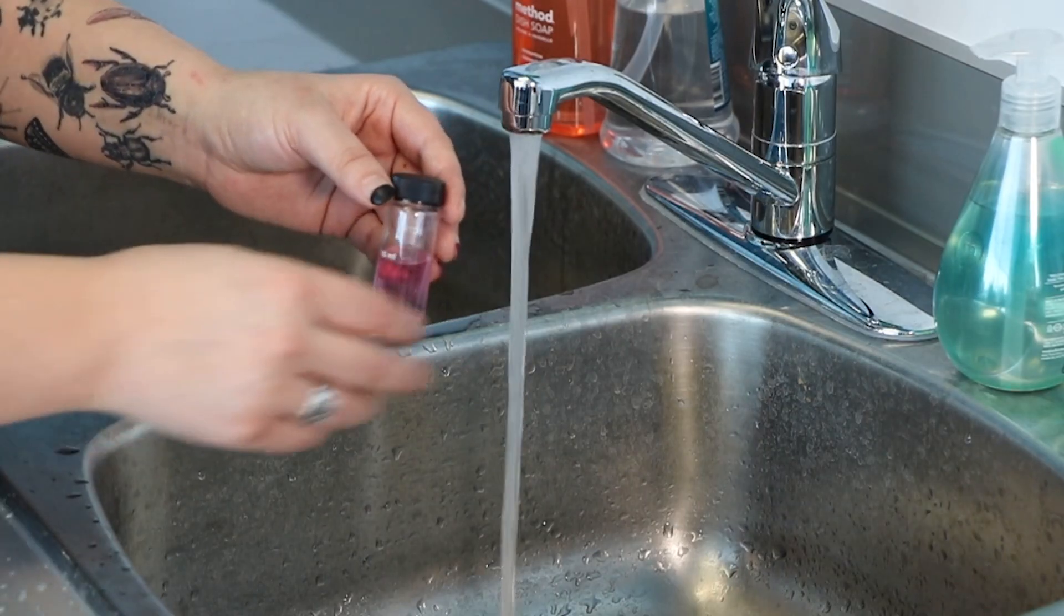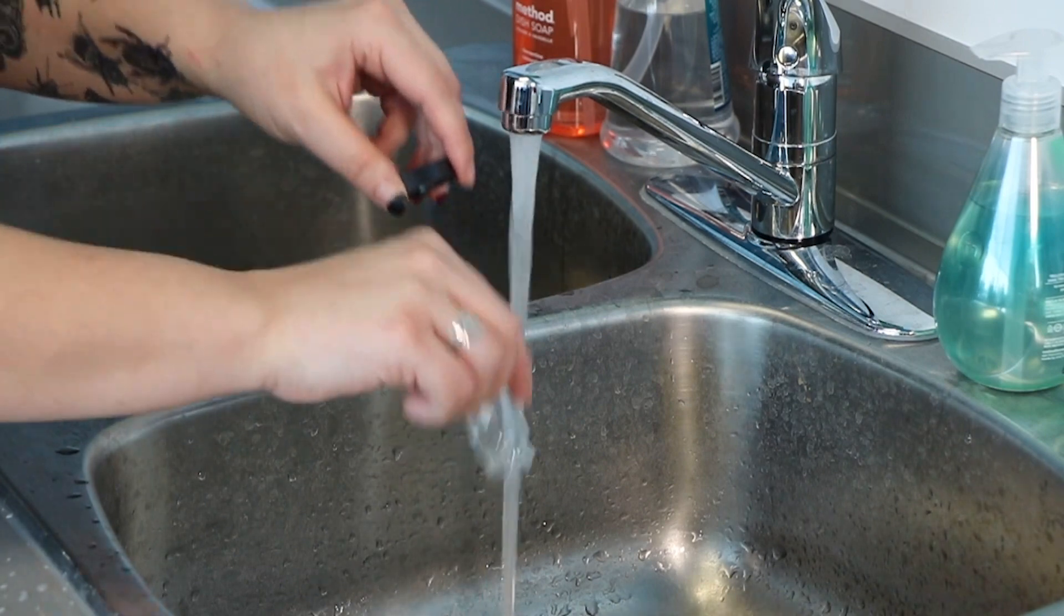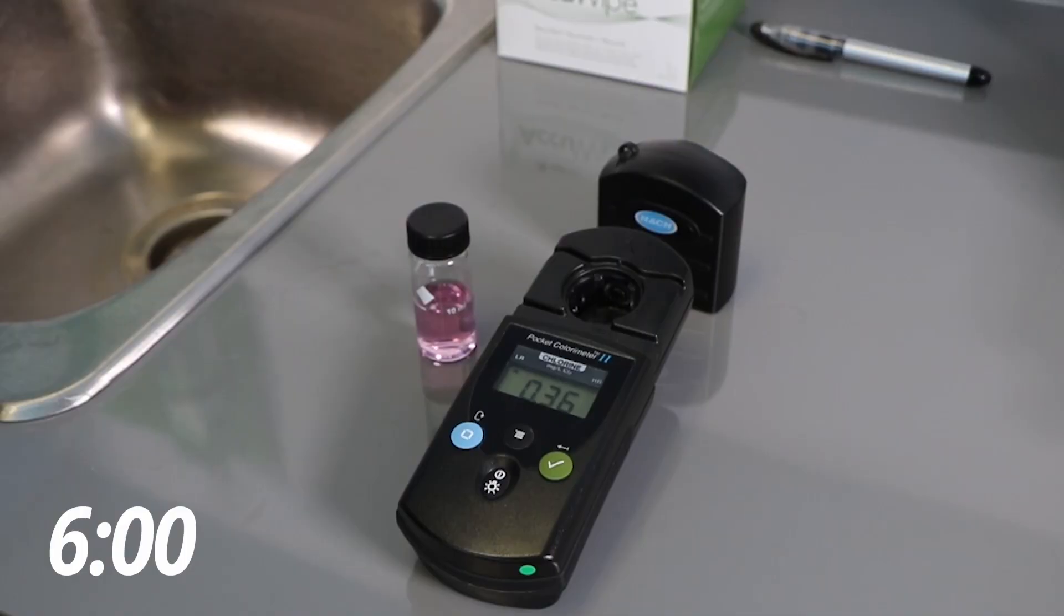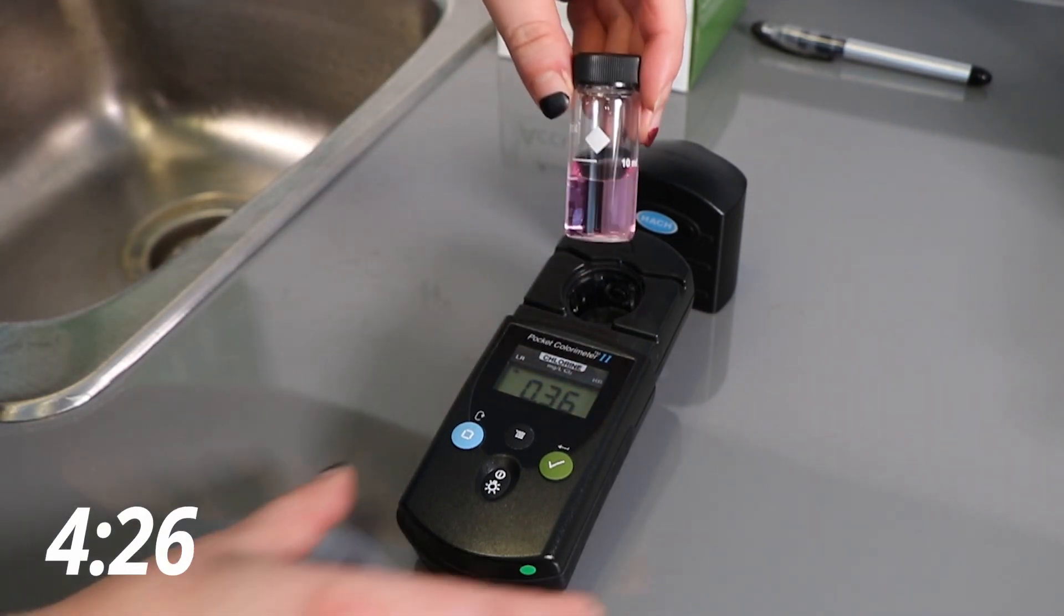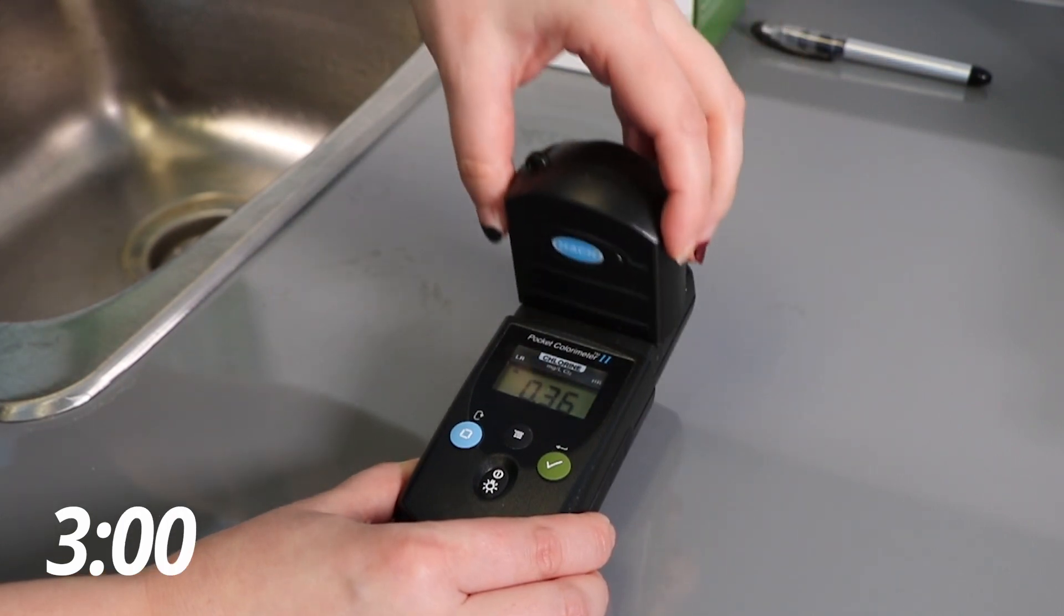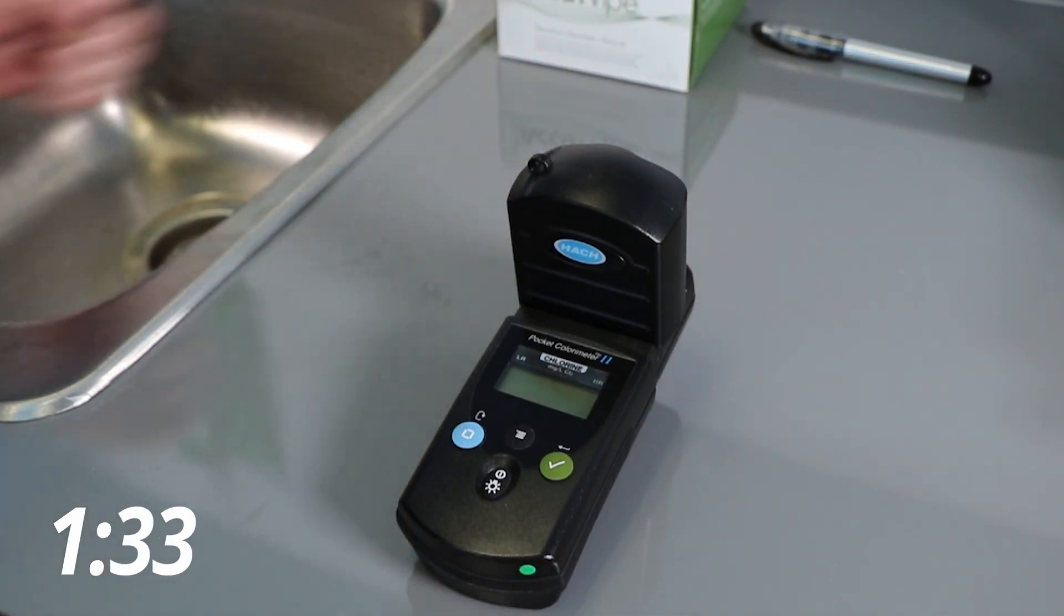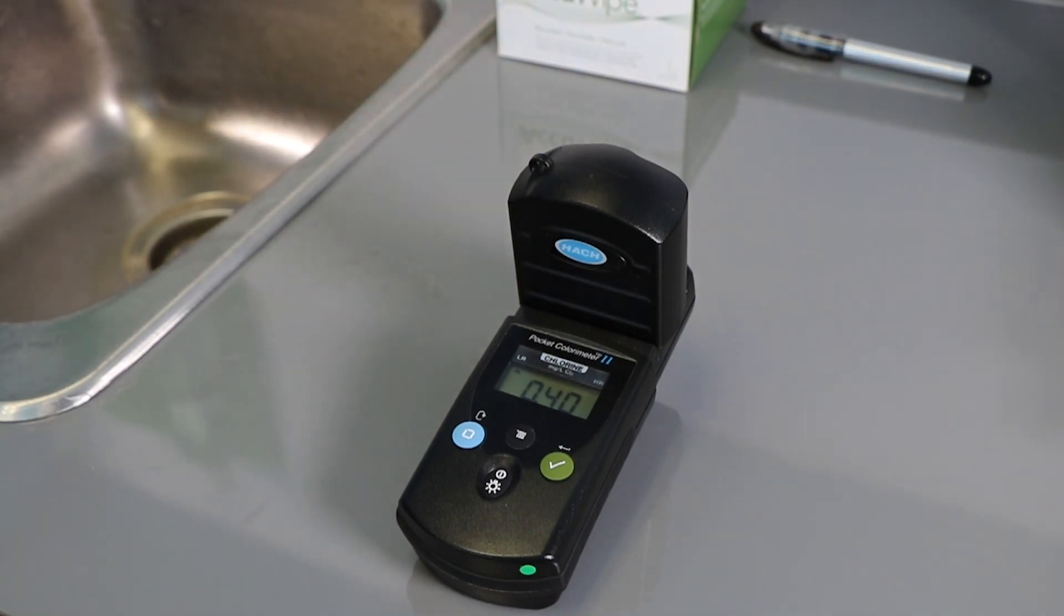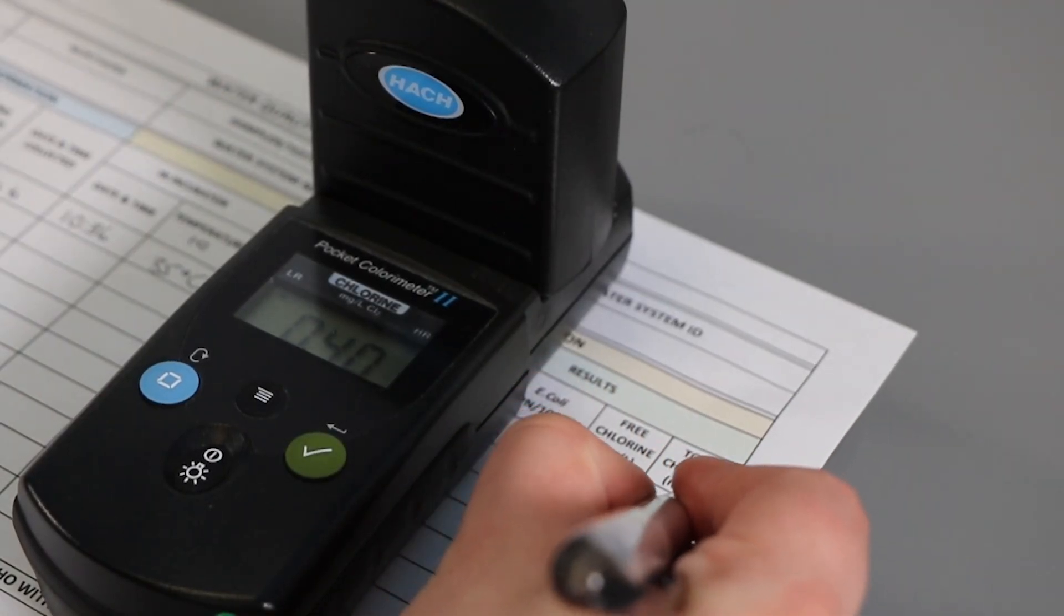When finished, thoroughly rinse the sample vials immediately several times. For total chlorine, you need to wait 3-6 minutes after adding the DPD to the sample water. Remember, the instrument now displays the chlorine residual in milligrams per liter. Record the number on your field sample data sheet.